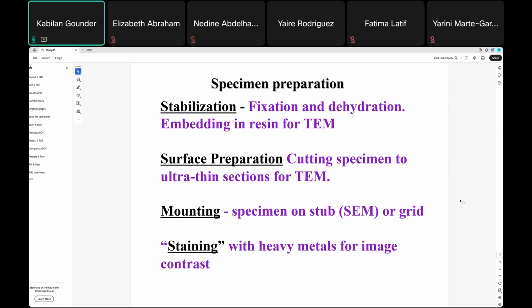It's a cryomicrotome because the cryomicrotome takes sections of your material below 0 degrees. Similarly here, we have to take sections, and we call it an ultra microtome. The ultra microtome takes sections at nanometer thickness. You can imagine that compared with light microscopy, which is micrometer thickness, here it is nanometer thickness. That's why we call it an ultra microtome.